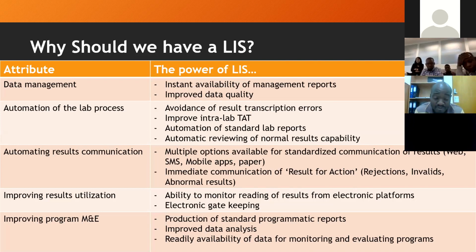We've also seen an improvement in intra-lab turnaround time, because not everything is done manually, but there are electronic processes in place. By so doing, you can also have an automated standard report.